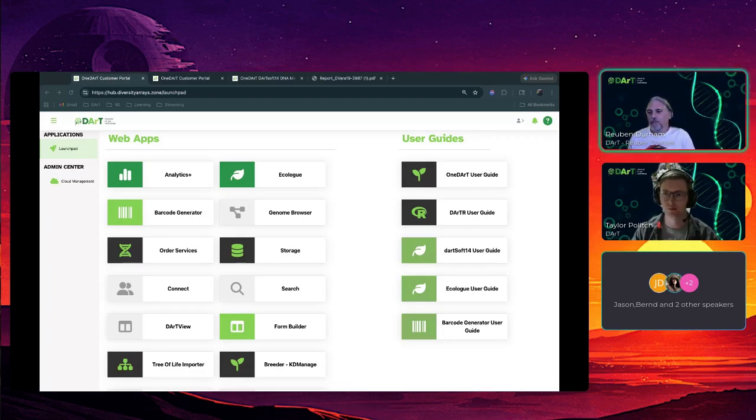Since this is very dependent on the actual samples that are within that selection, if somebody gets some more samples in, they would need to request a co-analysis. But now, with putting this into the OneDART platform, we want to put this into the end user's hands, so researchers can reanalyze their data with different parameters, perform co-analysis with subsequent orders that come in, or data from new collaborators, or particularly as an iterative process, depending on the results you get from dartR.